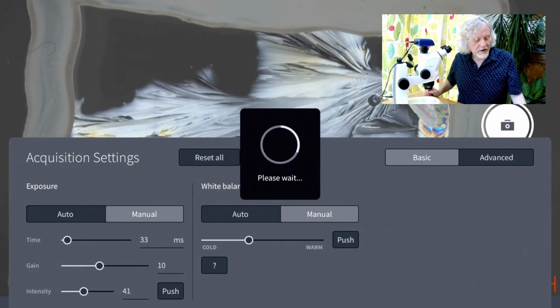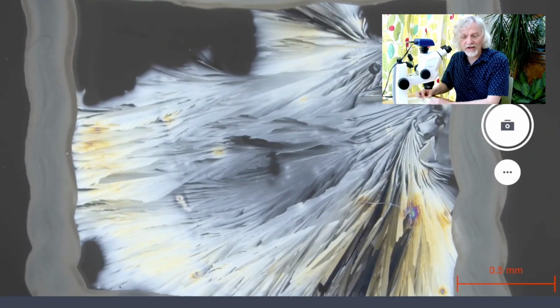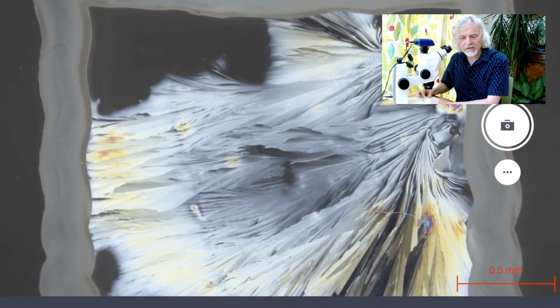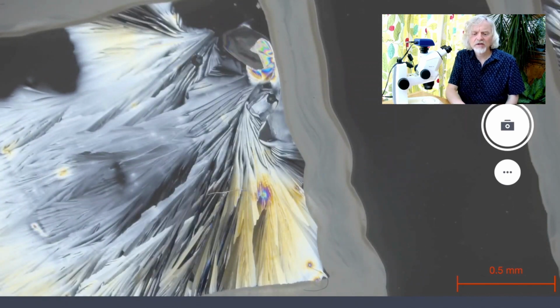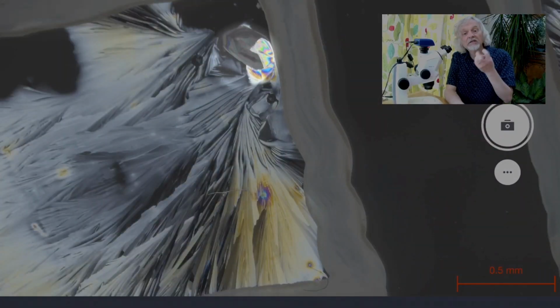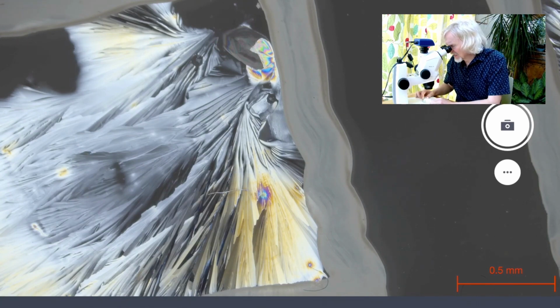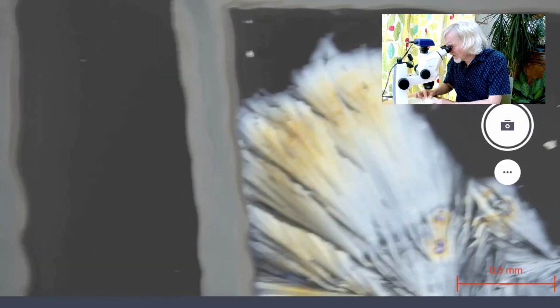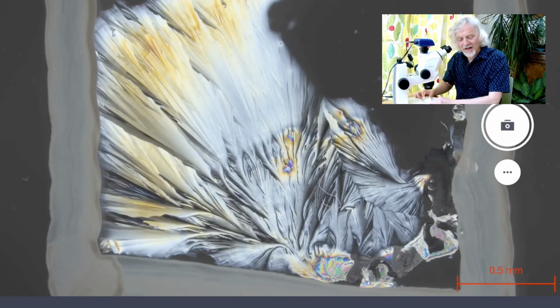So what you've got here is the little square I drew, and then it's under my head. Just there is actually an undissolved crystal of citric acid that was just sitting on top of the slide. And from that grew all these crystals. And I actually watched these grow as I was sat here. They've finished growing now, but there's another one over here which is rather lovely. Look at that. Isn't that good?